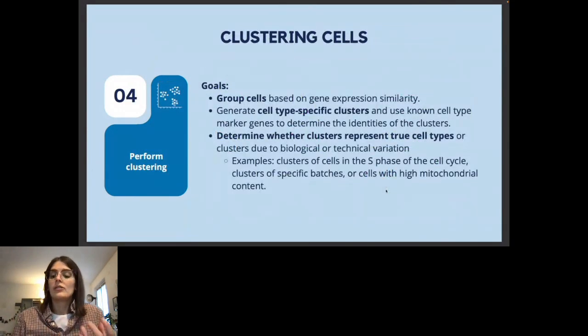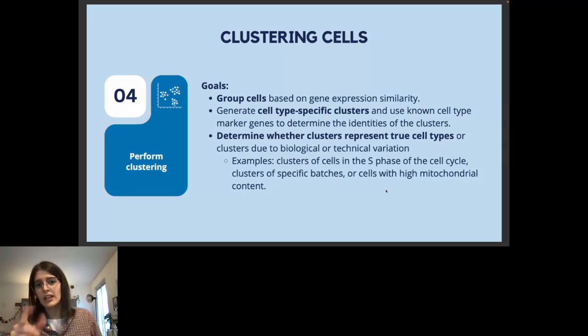Of course, the goal would be that one single cluster is then associated to one single cell type. And then we will see this also with the code. We will try different cluster resolutions, as it is called, which somehow indicate the strictness of the rules in order to distinguish one cluster from the other. And we will have plots later that will make this all clear.